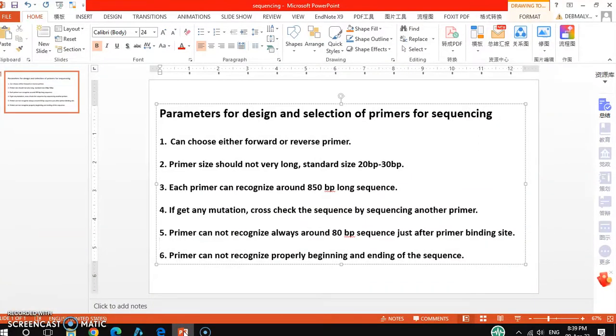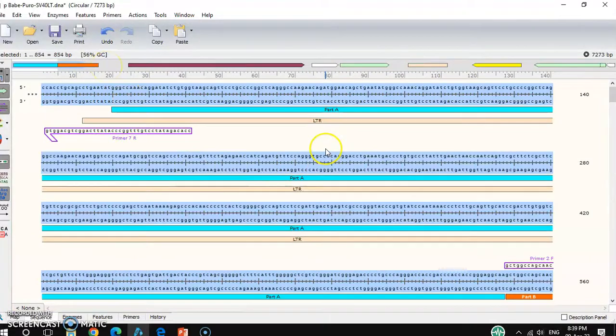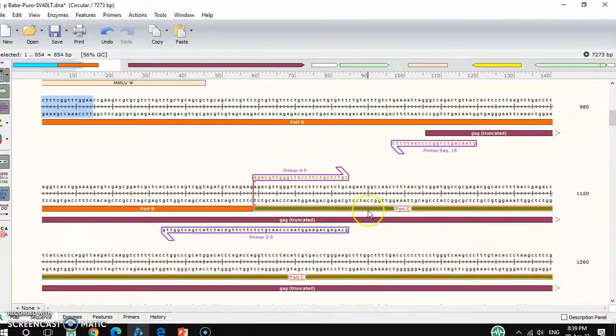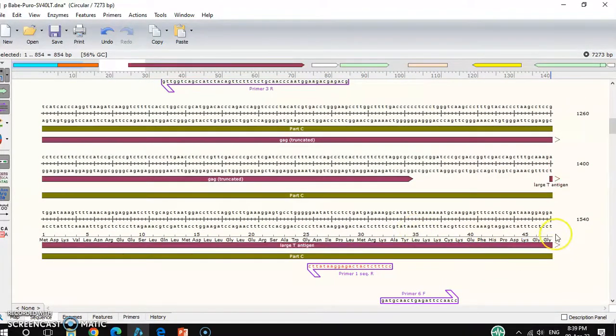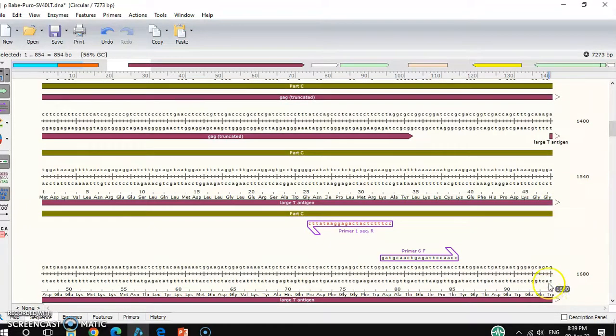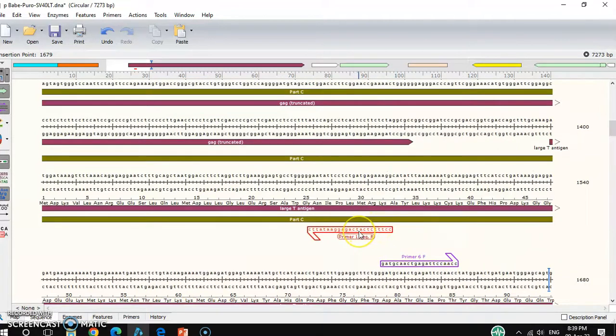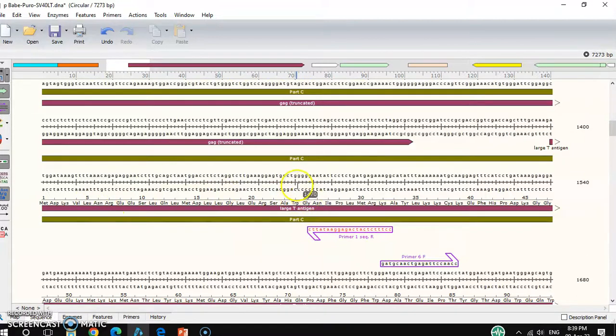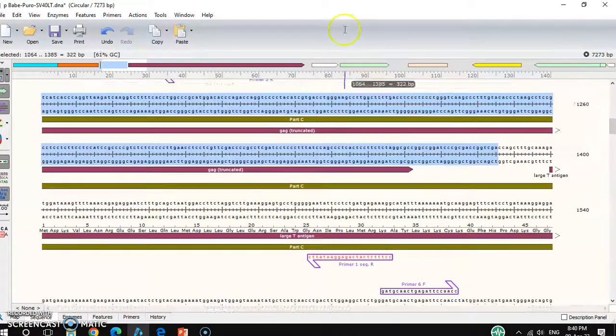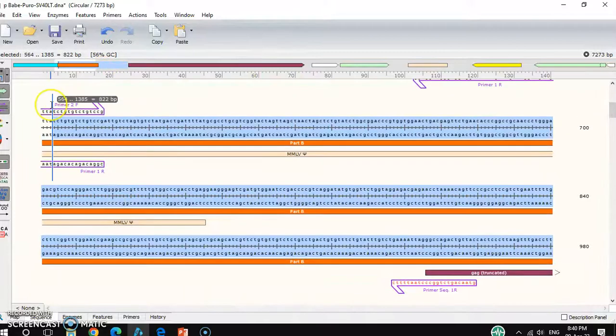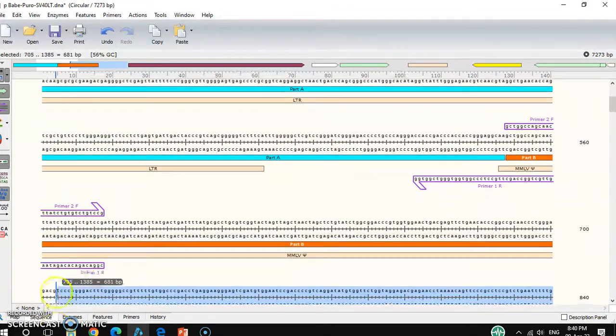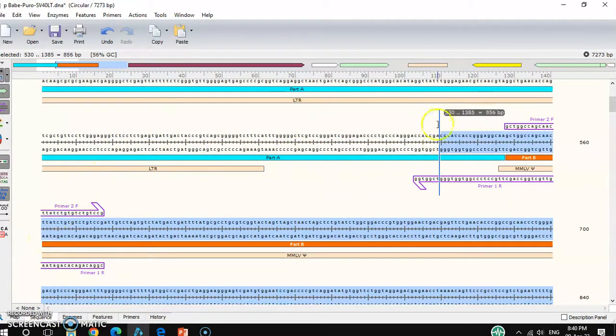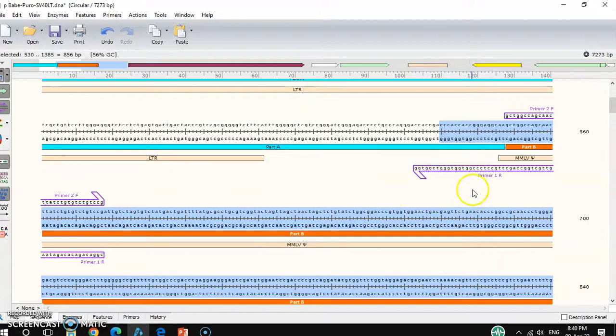These are all the parameters that you have to keep in mind before selection of the primers. For example, I would like to select around 1500 to 1600 base pairs I would like to sequence. For that, which primer do I need to select? This primer I can select. This primer can recognize up to this. 80bp long it cannot, so after that, from here another primer set.